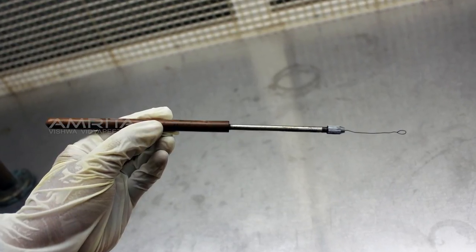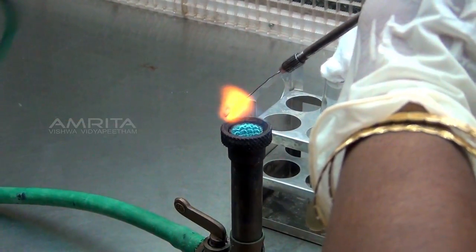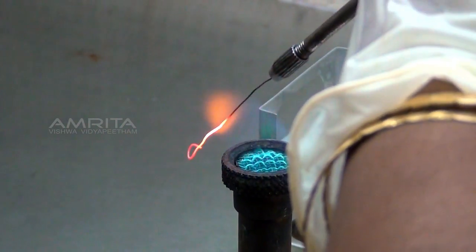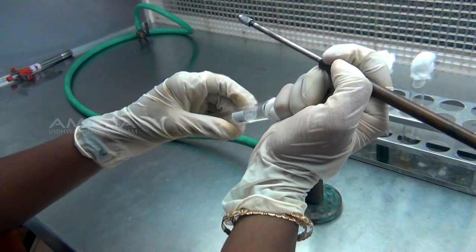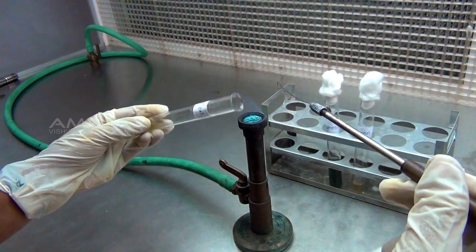Take an inoculation loop and sterilize it in the blue flame of the Bunsen burner till red hot and then allow it to cool. Remove the cotton with the small finger of your right hand and flame the mouth of the tube.